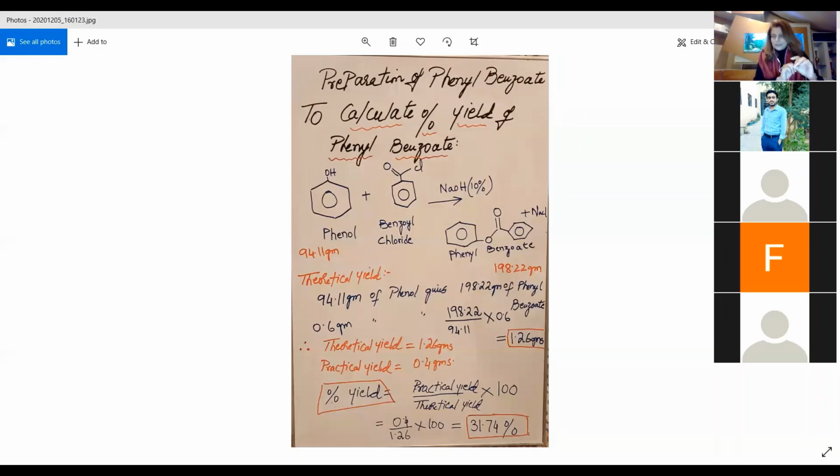So there is a digital device. Digital devices are there, and people do not use the classical method, what we are doing, using the paraffin oil and what else. But when we have nothing, we say, thank you, Allah Pak, we do it with this method. We will not stop our work, and we will use this method. The classical method is always there. The paraffin oil is always there. You can always record the melting point through these methods. These are always available. But in the advanced stages, when you are doing your MPhils, when you are doing your PhDs, you do need a proper melting point apparatus, right?